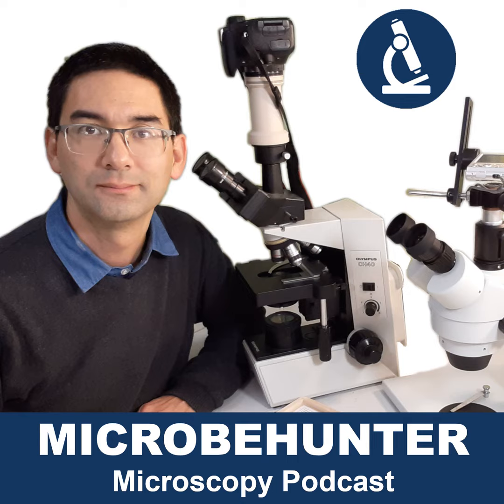The reason being that the USB cameras that you have these days still do not have a sufficiently high dynamic range. Now, what does this mean? The USB microscope cameras have the problem that they're not able, at least not as well as the human eye is able to, to catch both very bright and very dark areas at the same time. As soon as something is a little bit too dark, it will come across as completely black. And as soon as something is a little bit bright and there are some details in the bright area, you also cannot see it. Okay?